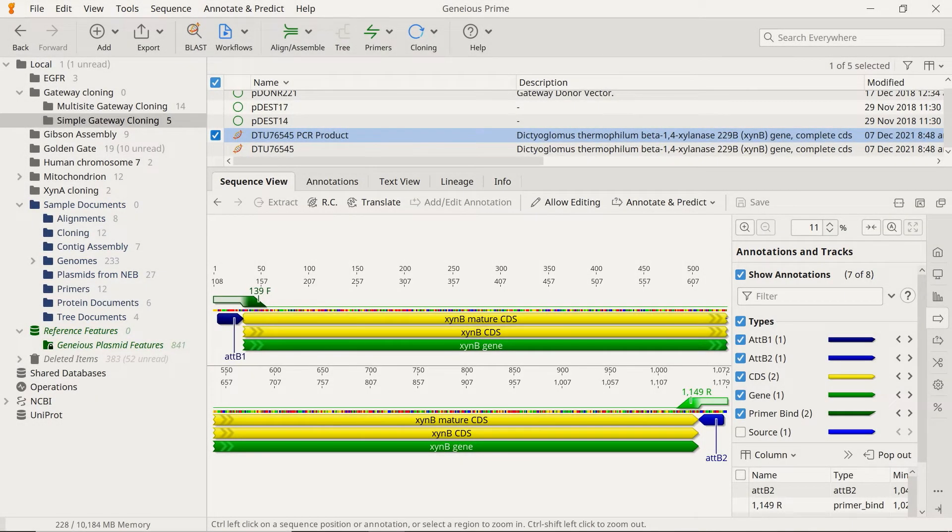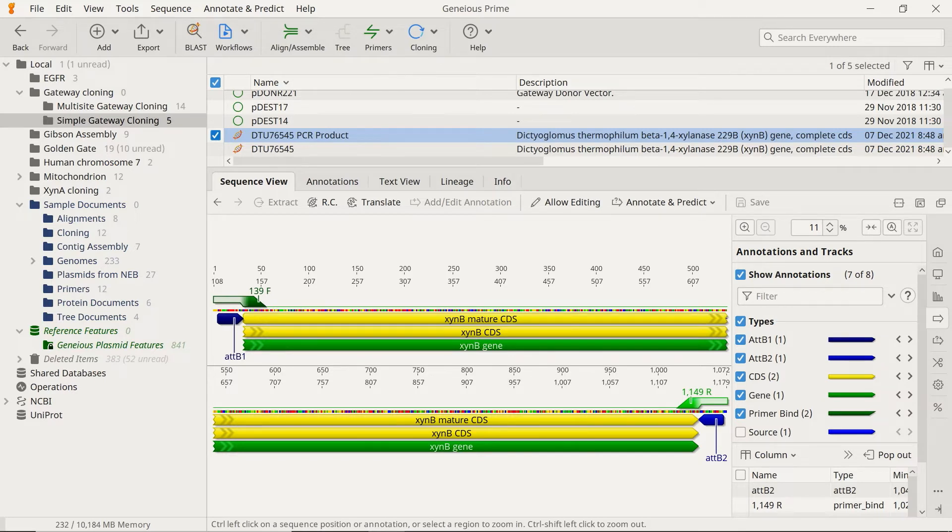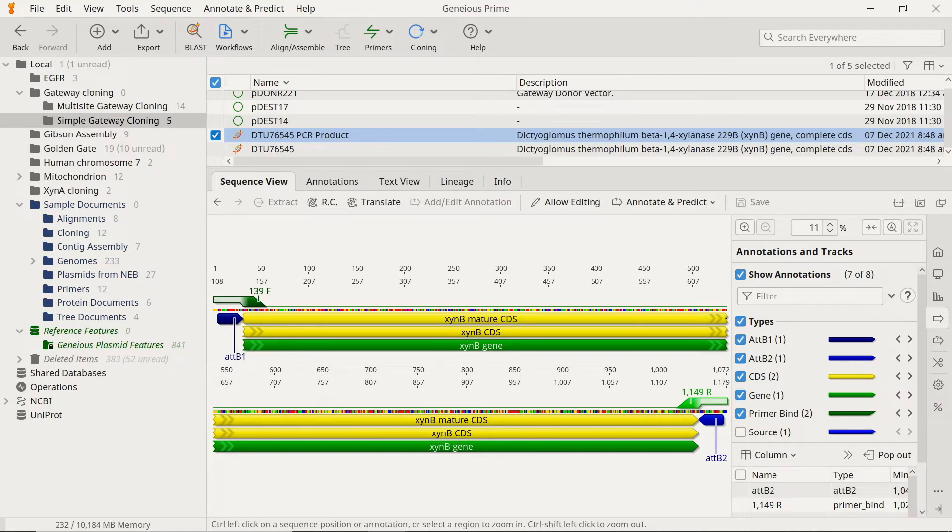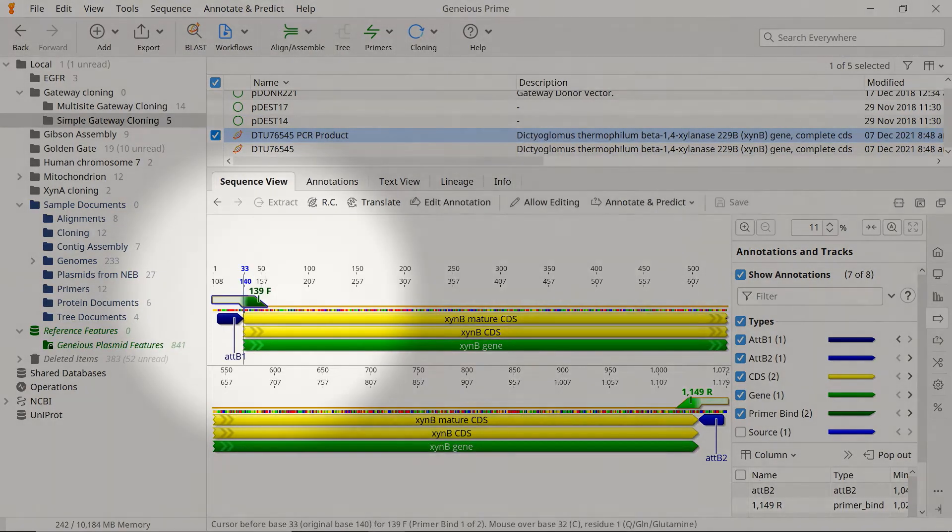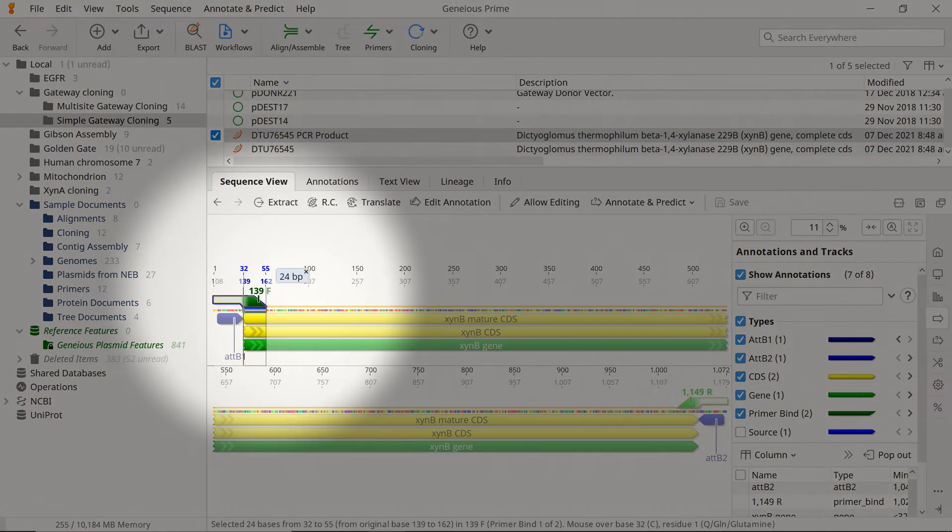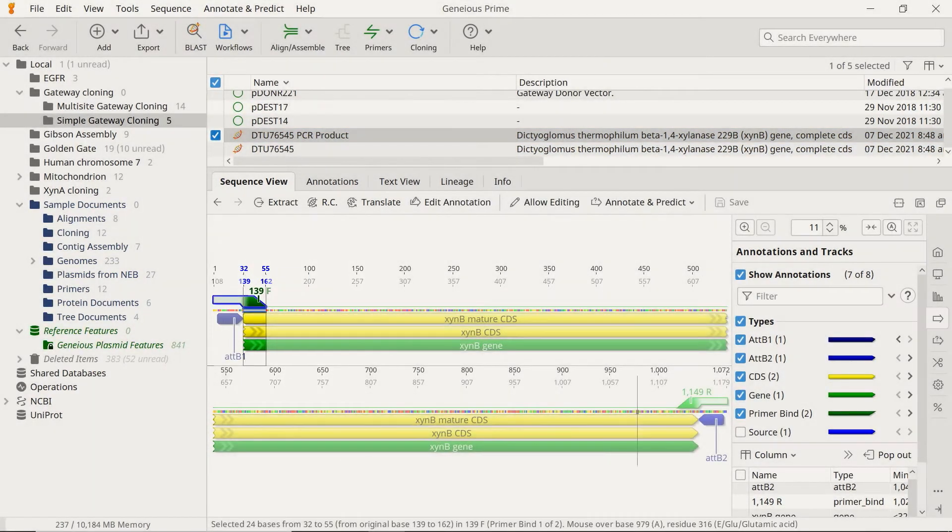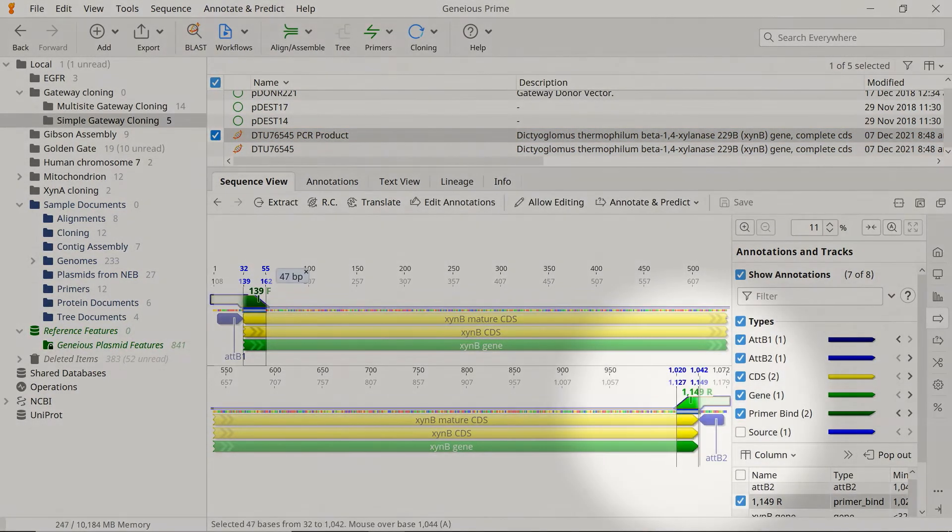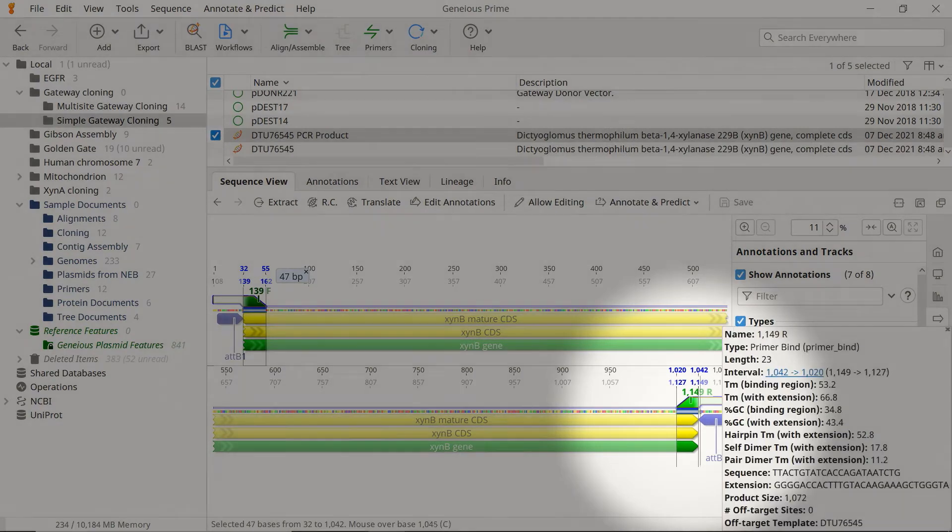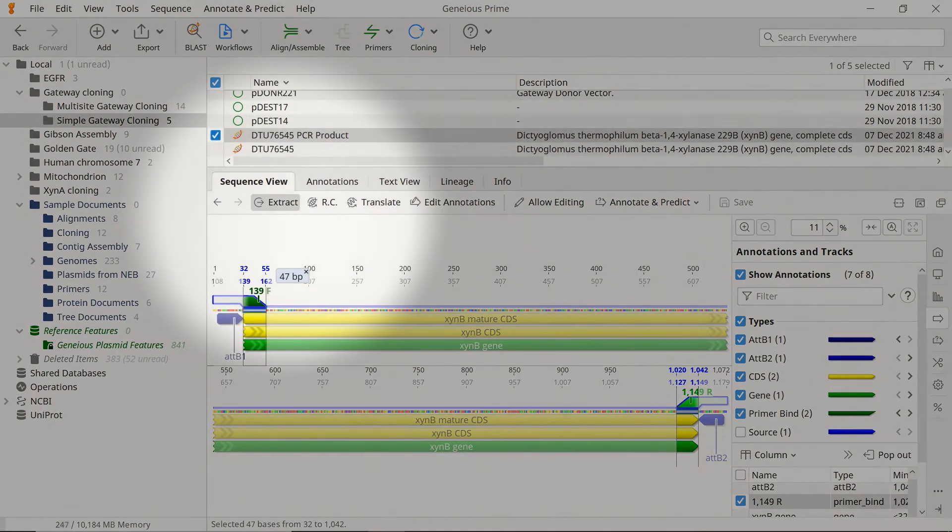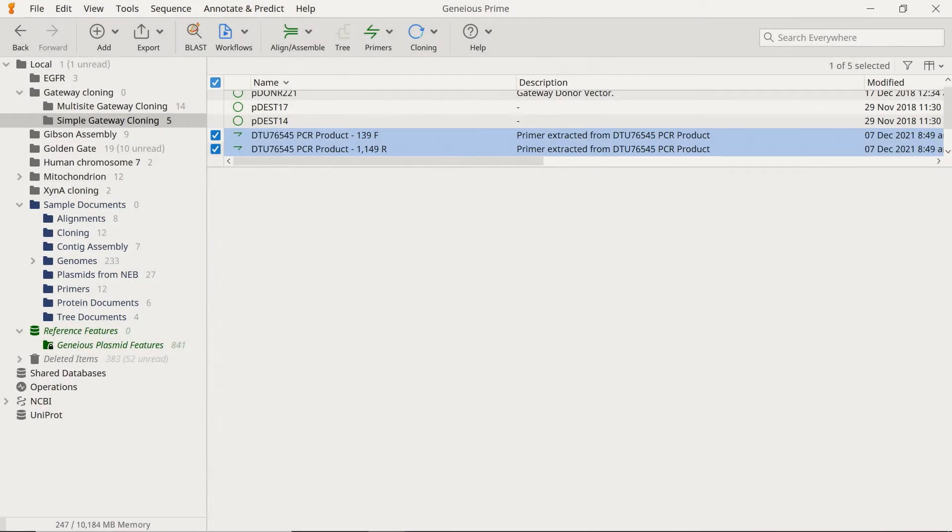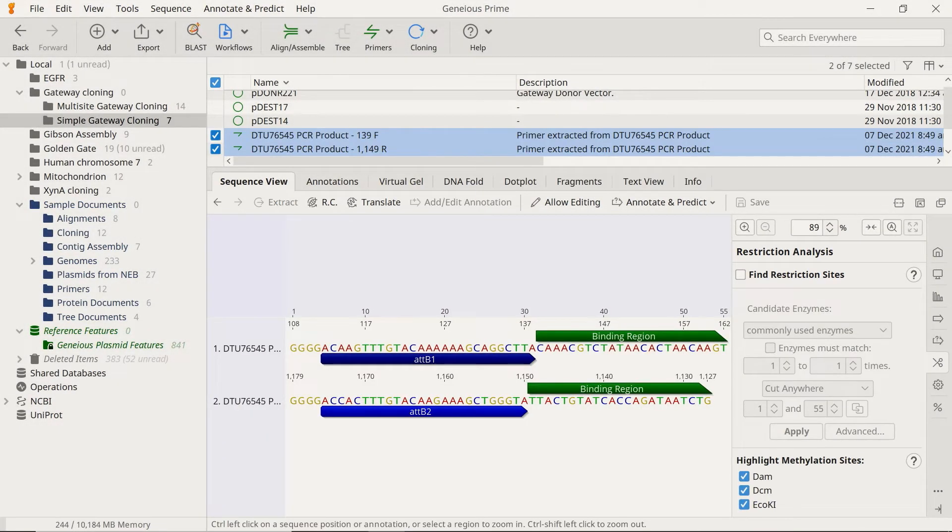Genius will create a new sequence file with inward-facing attB1 and attB2 sites, flanking the PCR product at either end. To extract the newly designed primer sequences for easy ordering, select the first primer in the Sequence view. Hold down the Control key, and select the second primer. Then click Extract.